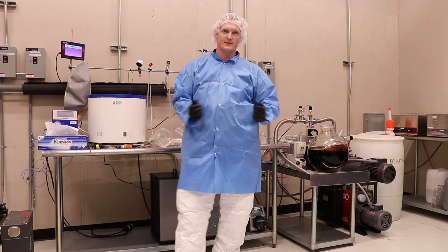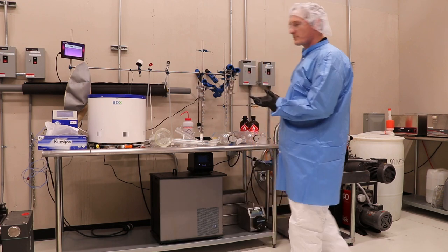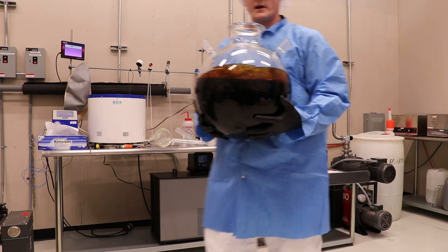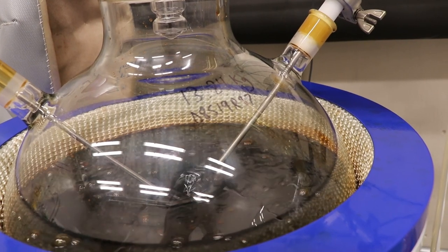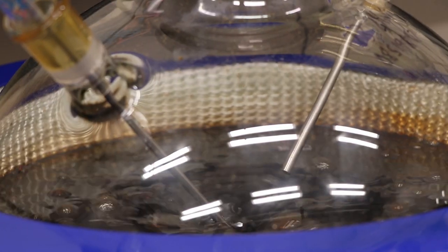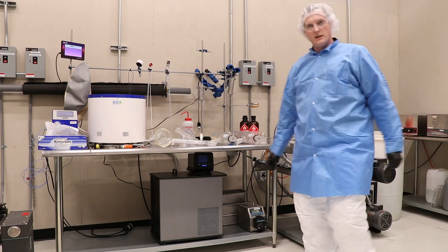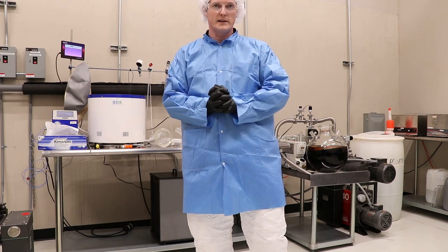Today I'm going to be showing you guys how we do a Delta-8 THC distillation using short path distillation apparatus. As you can see behind me, I have my round bottom boiling flask here filled with about 13 kilograms of crude Delta-8 THC that has already undergone a preliminary distillation to remove solvents, and we are going to be distilling that into a final product today. So let's go ahead and get started.